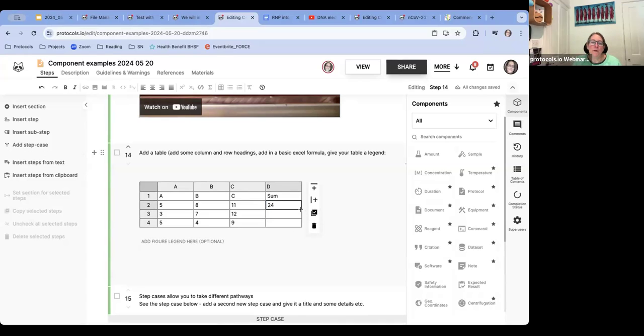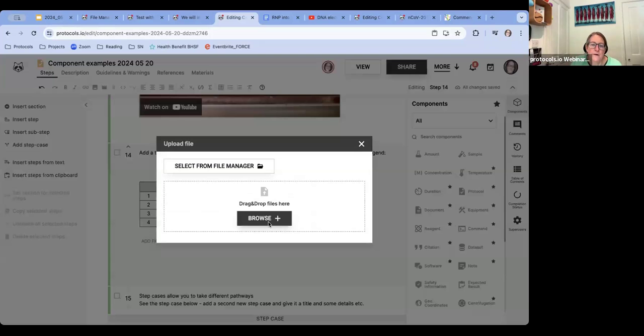And then you can pull it down and it will drag across. So it has very much similar functionality to Excel. It's not going to be a replacement for a really complicated Excel spreadsheet, but it does work quite well. What you can also do though is upload a file of an Excel spreadsheet as well, using the attached file if I browse.